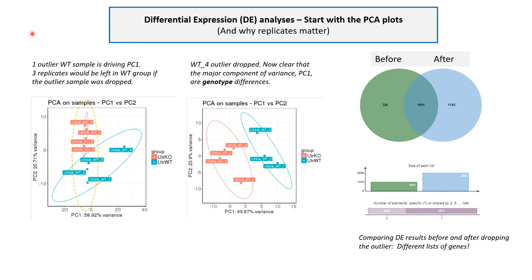In this example, comparing reads from wild-type and knockout utricles, it is apparent that one of the wild-type samples, number 4, deviates from all the other samples, knockouts included. There are statistical tests to determine whether a sample is a true outlier, and wild-type number 4 was determined to be a statistical outlier in several purely technical aspects. We can remove wild-type number 4 without compromising the analysis because we still have 3 biological replicates, the minimum number for a statistical analysis in the wild-type group.